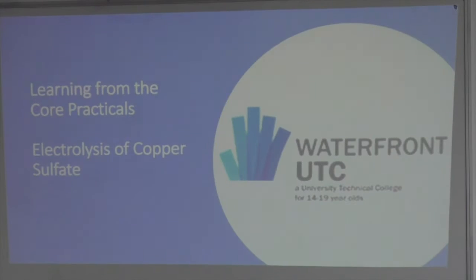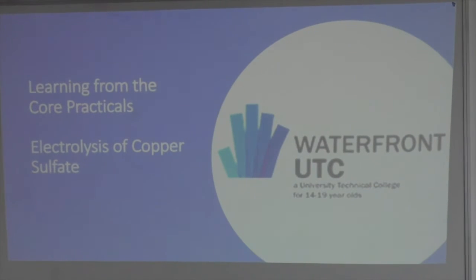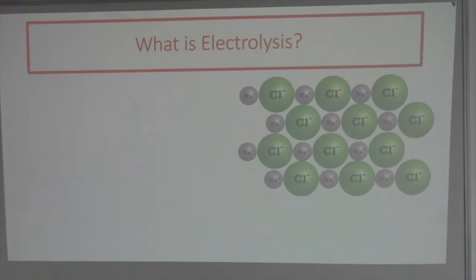Welcome back to Learning from the Core Practicals. The experiment we're going to be looking at today is electrolysis of copper sulfate. Let's have a look at the theory first before we start the experiment.